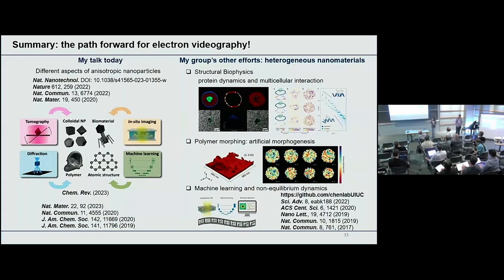And then for our self-assembly experiments, that's very different, because, as I mentioned, we need to have large enough free space for a lot of nanoparticles to diffuse and interact with each other. So for those experiments, usually the liquid thickness needs to be several hundreds of nanometers or even larger. So the balance you want is, if the liquid thickness is too large, then the resolution is going to be lower. That's just something one needs to keep in mind.